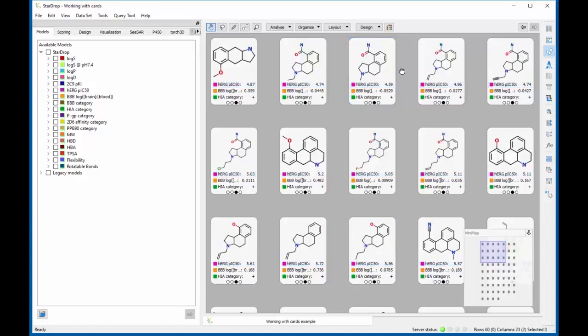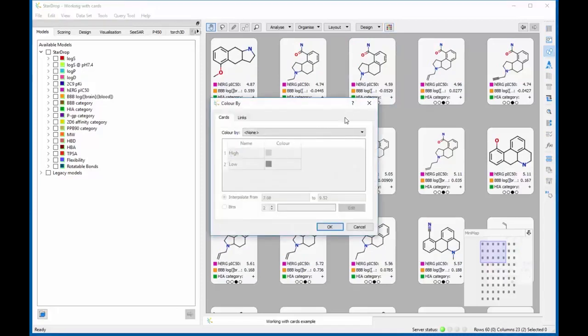Finally, you can color cards by any property in your dataset to highlight interesting compounds, simply by clicking on the color palette.